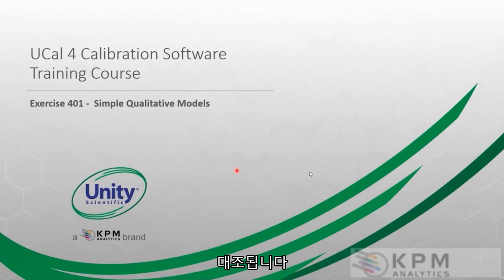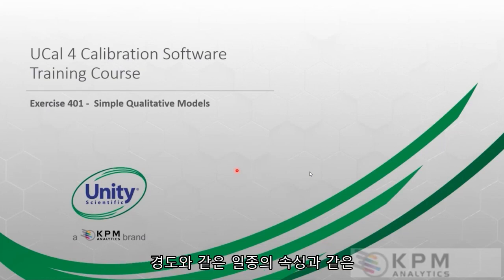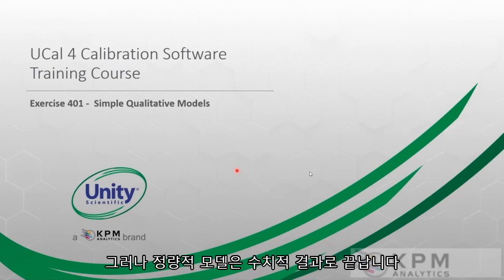In contrast to our quantitative models, those are the ones that are predicting some sort of a compositional value for our sample, or some sort of a property like a hardness, for example, or a digestibility or something like that. The quantitative models end up with numerical results.